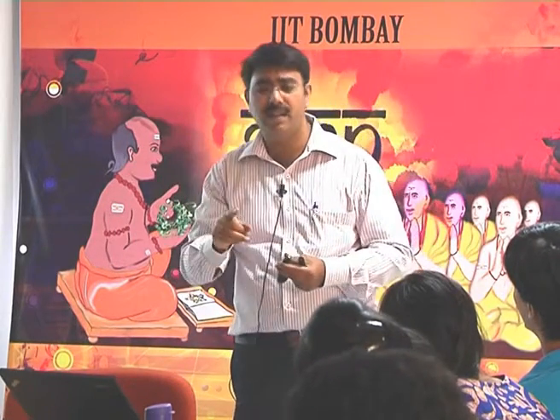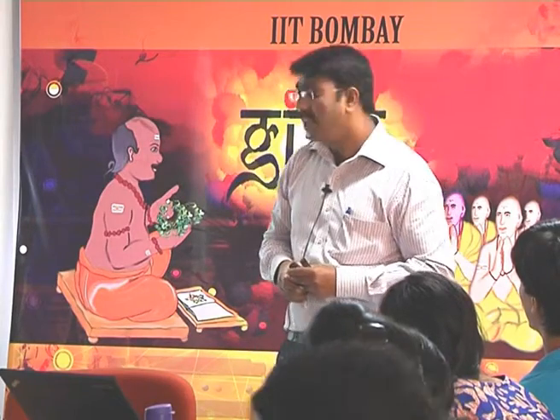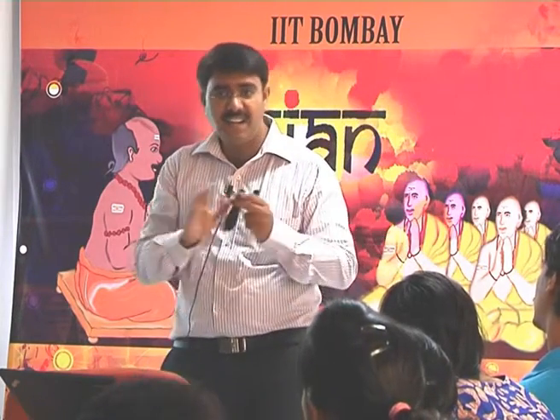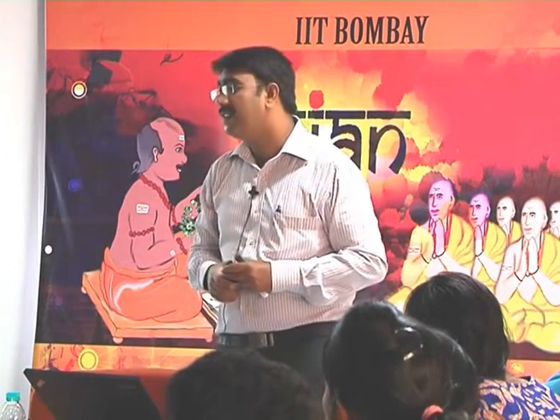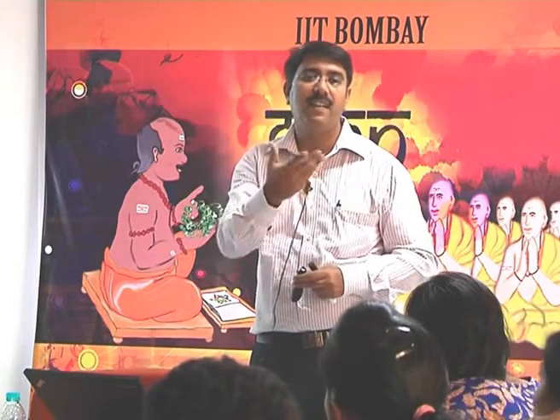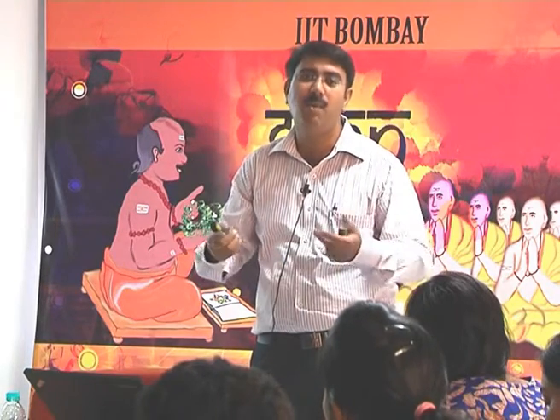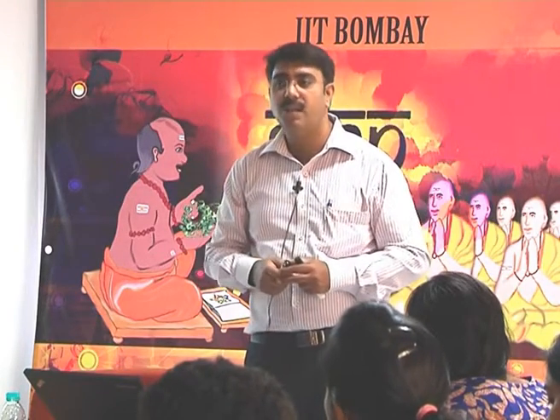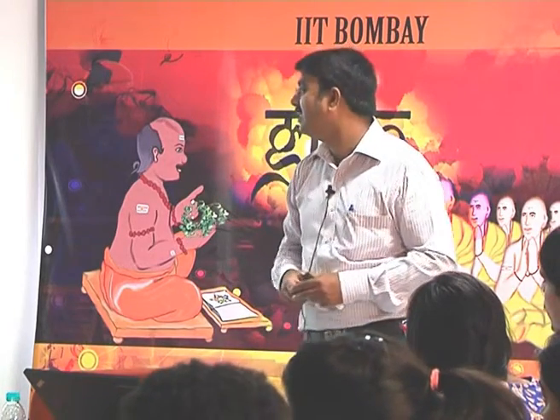But here it is a dip and read. If something goes wrong, we can throw away a sensor, but there are no such fluidic devices here. And the high throughput, as I said, is 8 channel or 16 channel, depending upon the application we can use. Unparalleled ease of use. I can show you how user friendly the software is. If I train you for half an hour, you yourself can work on this instrument. Anybody can operate it. In case of SPR, you require a dedicated operator. So here it is such an easy system.